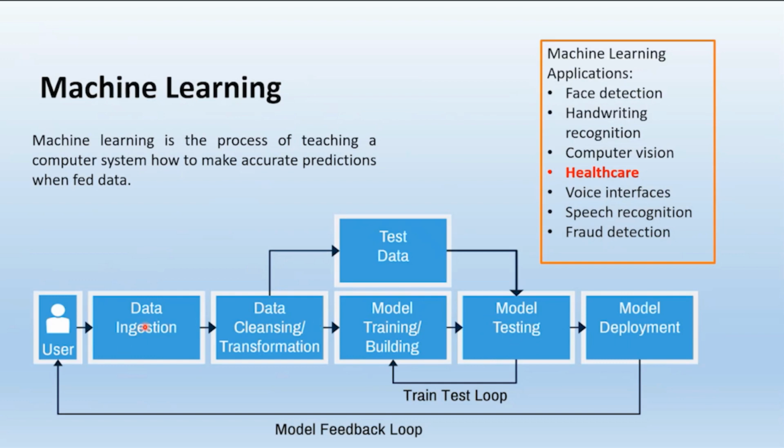So you would split your data up. Part of the data would be made to build the model. The other part of the data would be used to test the model that you've built. So you keep this group of data away from the model initially, and then add it back into the model to make sure that the model you're building is actually precise, and have a way to test it.